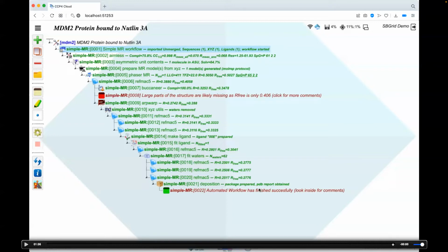Well, I think it looked good, but if you add the achieved R factors, then you can see that the structure is definitely solved, no doubts about this, but it is definitely also not fully refined. The R-free of 27% is a bit too high for a crystal of this kind. Right, so how may this be improved, how may this project be taken further now?